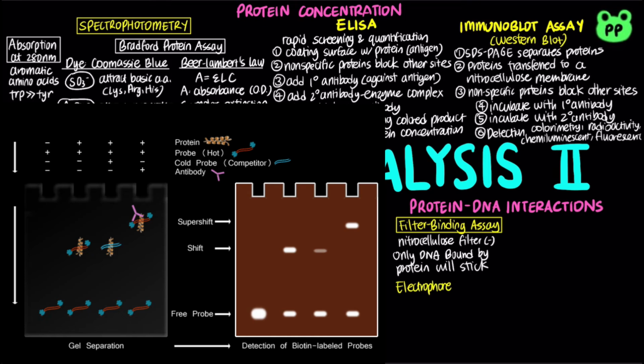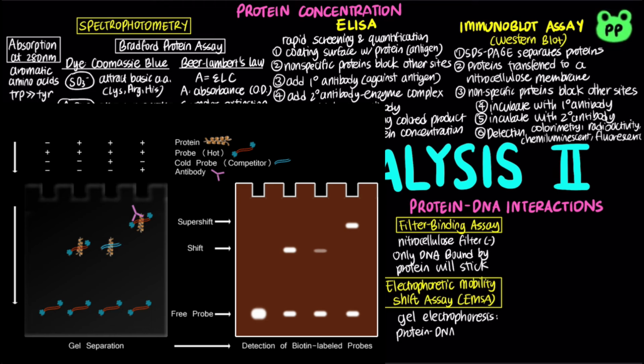The electrophoretic mobility shift assay, abbreviated as EMSA, uses electrophoresis of either polyacrylamide or agarose gel to separate a mixture of DNA and proteins. The speed is determined by their size and charge. The lane with a protein-DNA complex will move more slowly.